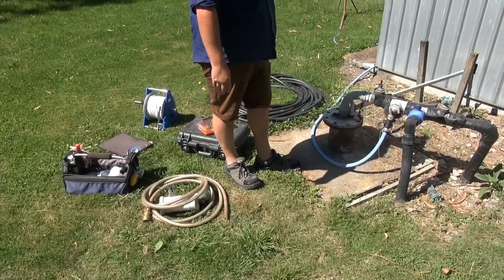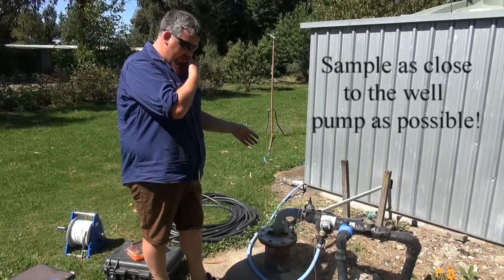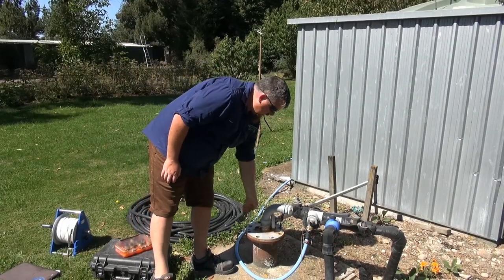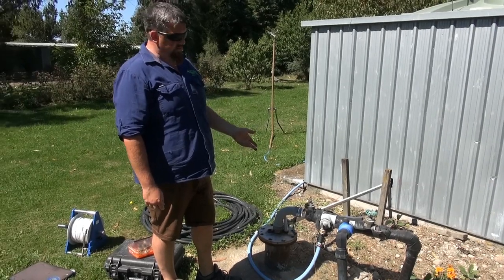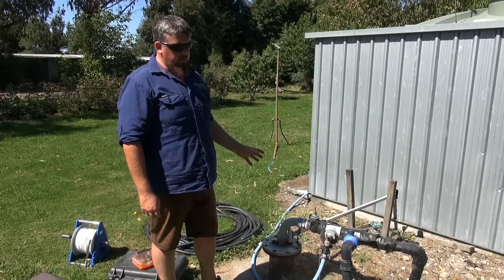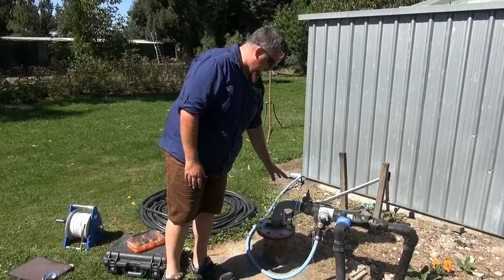These are your three volumes, and once you've done your three volumes you should have a representative sample from the aquifer. The key point is to find a sample point that is as close to the well pump as possible. If it's below about 6 or 7 metres you'll usually have a submersible pump, so you can put a sample point anywhere from there back — the closer the better.